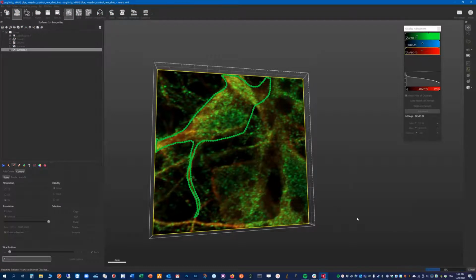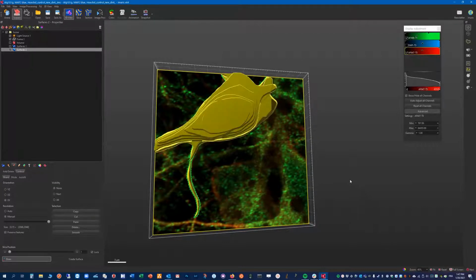It takes a bit of time since the resolution is quite high, but that's precisely what we want. And then eventually, hopefully, we will get our object. Once the object is created, we can redo the same procedure to build up the next cell and so on.